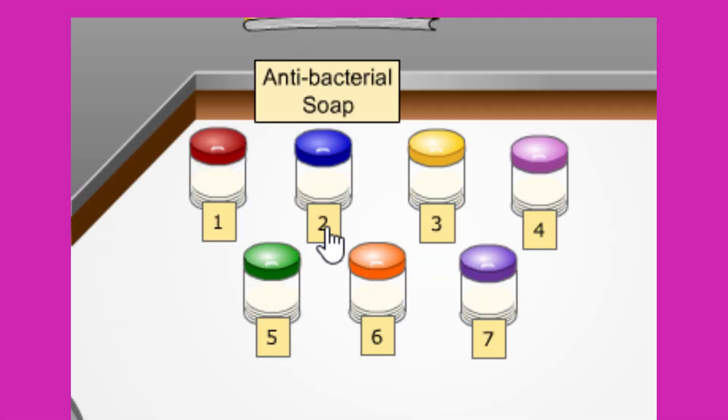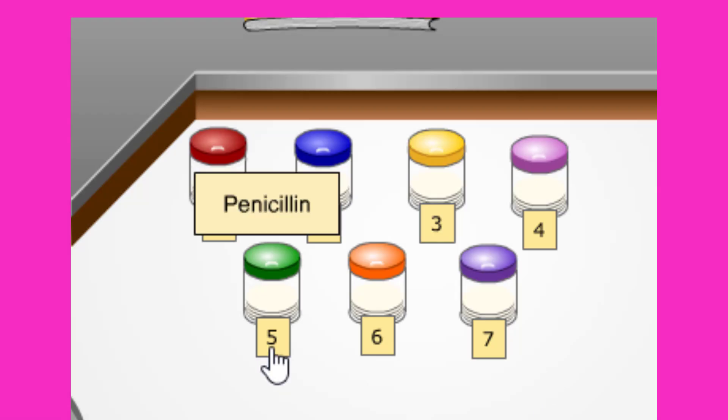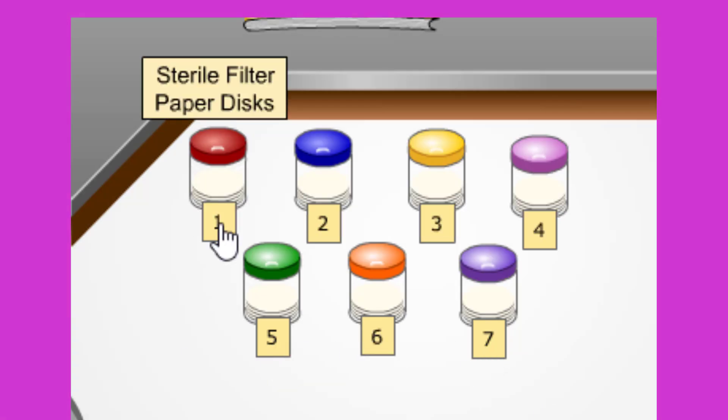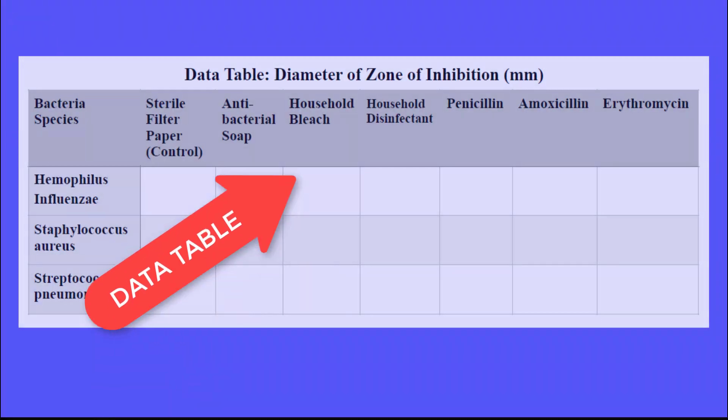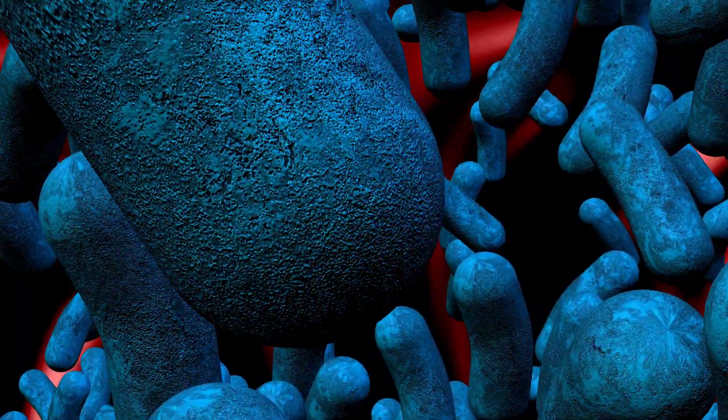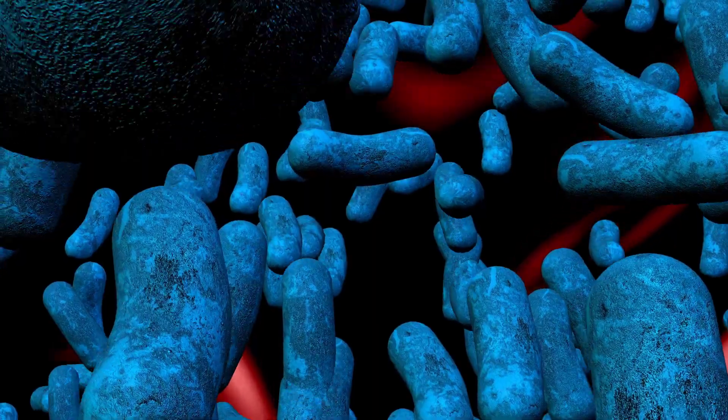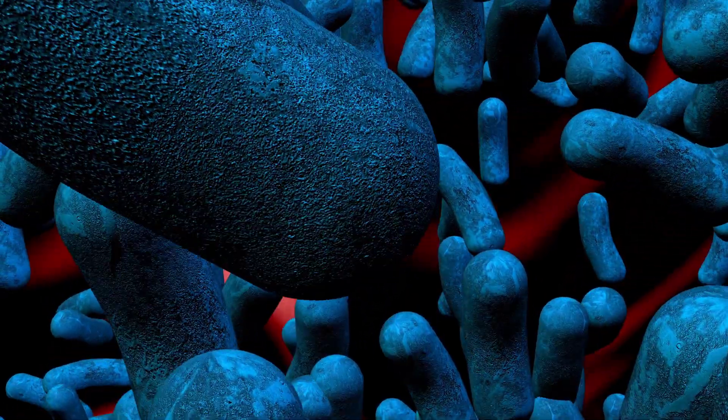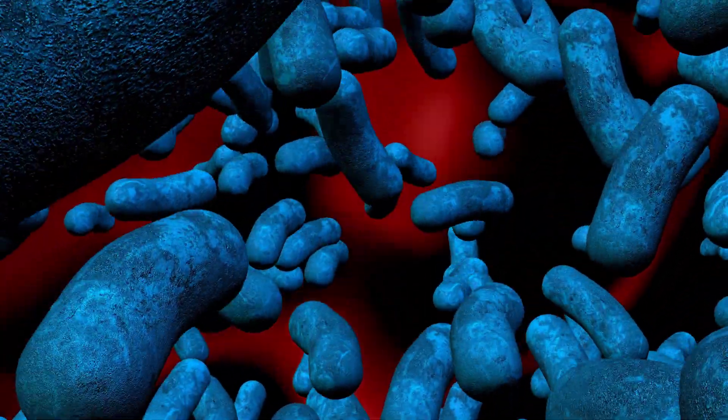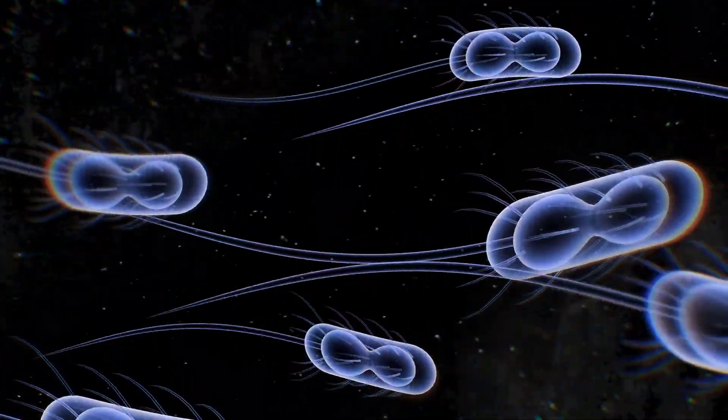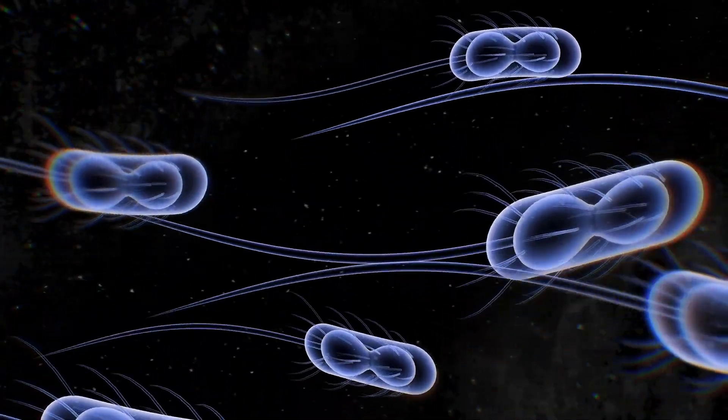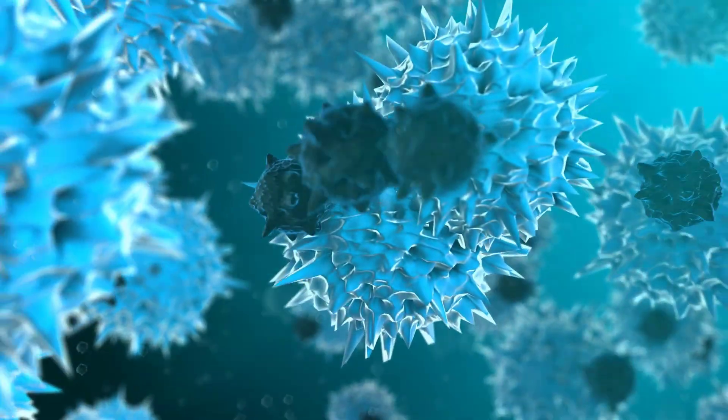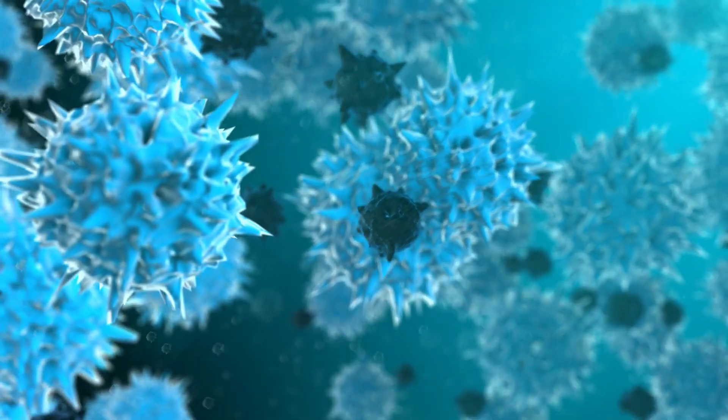To find out which antimicrobial agent responds to a specific number, move the cursor over the number. Use the table provided to keep track of your measurements for each antimicrobial agent by recording the zone of inhibition in millimeters. When we are done with each bacteria, we can click the reset button. Once we have gathered all of our data, we can use the data in the table to compare the effectiveness of different antimicrobial agents on different bacteria. Be sure to complete the journal questions and be prepared to upload your data table for your instructor to grade.